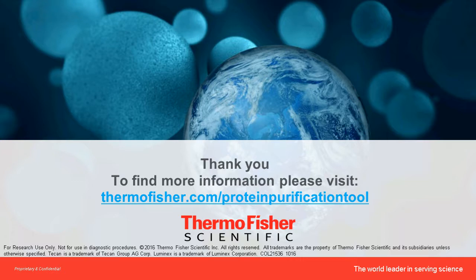You may have to start with like 50 microgram of starting material all the way up to like 400 microgram of starting material. And it's highly dependent on individual targets and the kits that are commercially available. So there is not a fixed number that you will find. ELISA overall is more sensitive for some targets, but for other targets we found they are equal with IP-MS. So IP-MS assays, we typically do at 500 microgram of starting material.